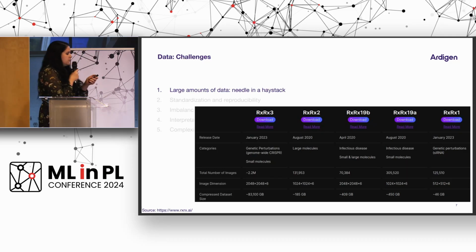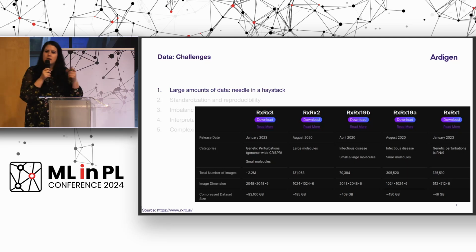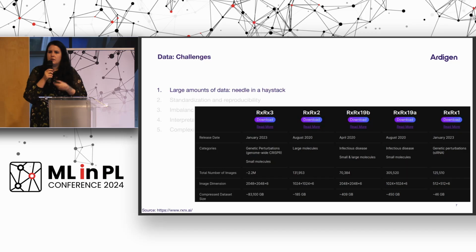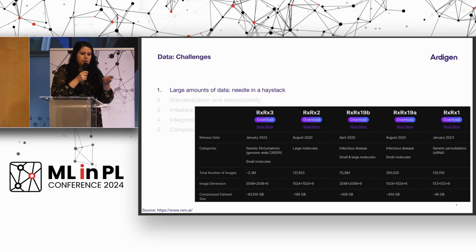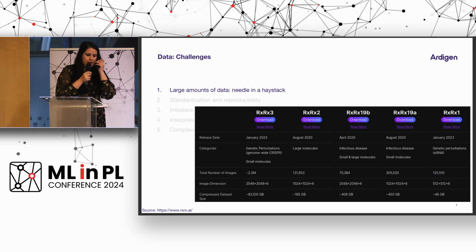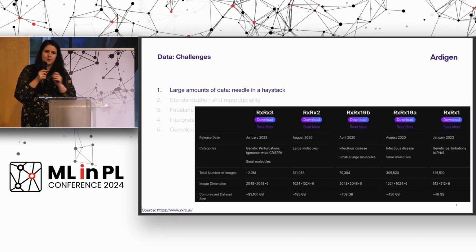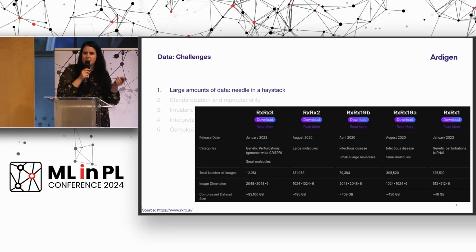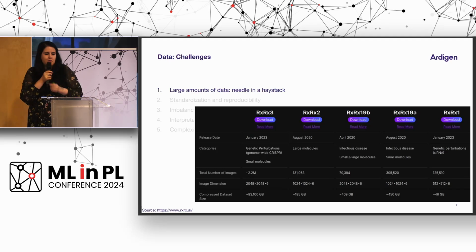However, at the last row here, you have the size of the data. And this one plate of data that I was showing at the beginning can produce around 20 to 25 gigabytes of data itself. And here we have even 83 terabytes. So first of all, we have a very, very large amount of data, and this is images. These are not labels for this data. We only know what the compound is and how it looks like on the image. Here we still don't know what it's doing.